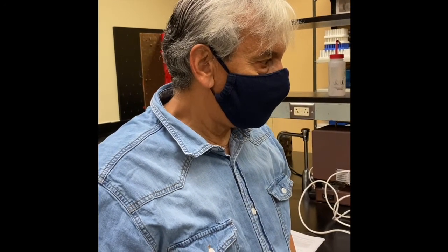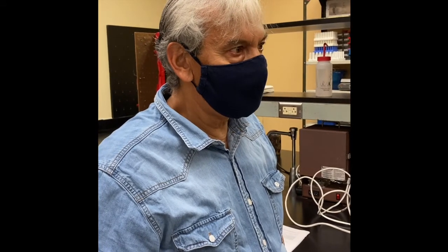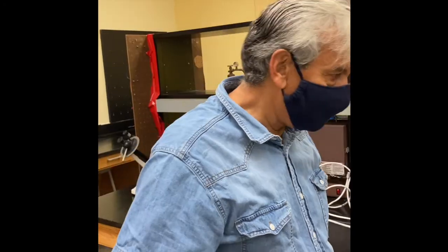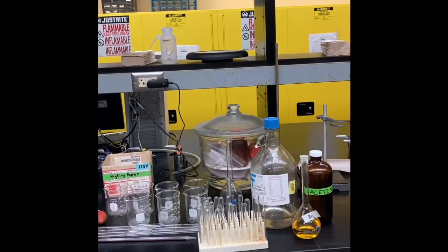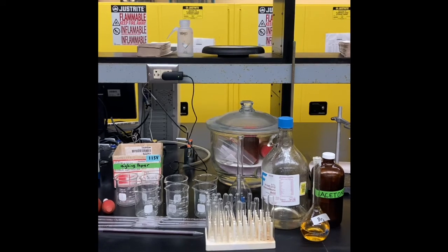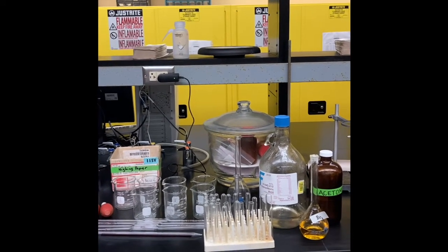Therefore, if we follow absorbance at 400 nanometers as a function of time, we can plot the concentration of Br2 in the solution as a function of time, and in such a way we can determine the reaction rate, which will be the slope of the plot of absorbance, and hence concentration of bromine, as a function of time.